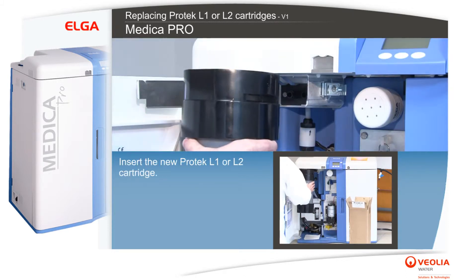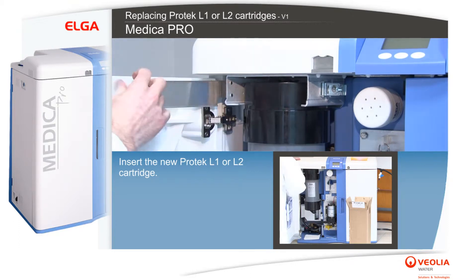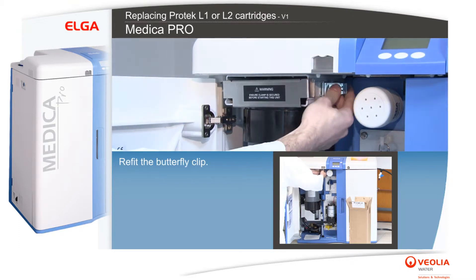Insert the new Protek L1 or L2 cartridge. Refit the butterfly clip.